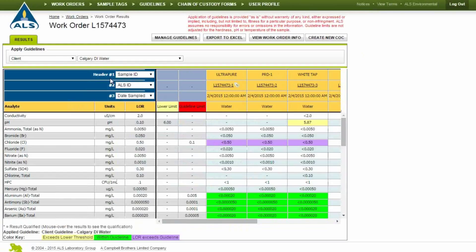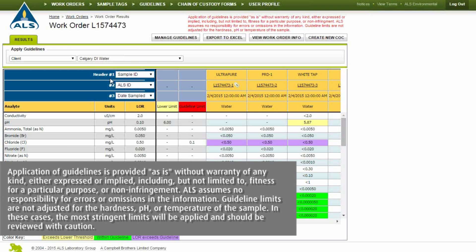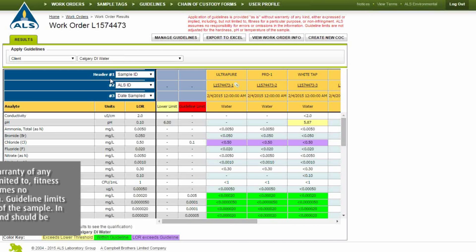Mouse over cells that are highlighted in red or purple to view the category failures associated with the result. Please note that the application of guidelines are provided as is, without warranty of any kind. Contact your ALS account manager for a copy of specific guidelines.